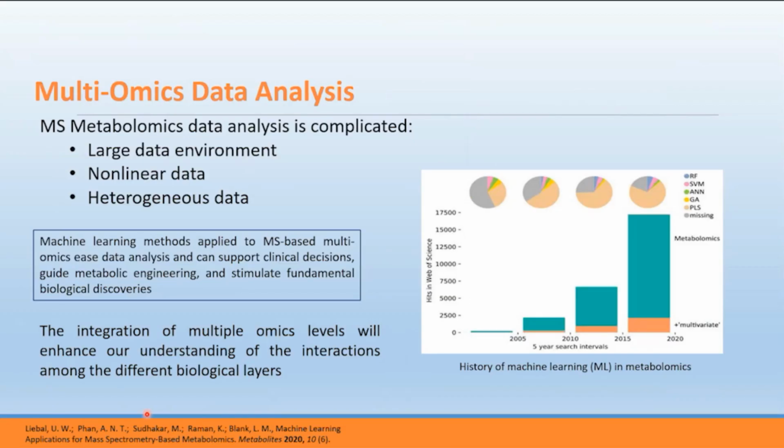And so then we take a step back with this study, and we could look at those together and individually and see what's going on. But we wanted to see what we could do with machine learning or artificial intelligence approaches with this kind of data set. What we know in metabolomics is that we create a large type of data, especially when we do multi-omic studies. And this is just lipids and metabolites. But if we layered in proteins and genomics, we would have many different omics approaches. You could even layer in glycomics.